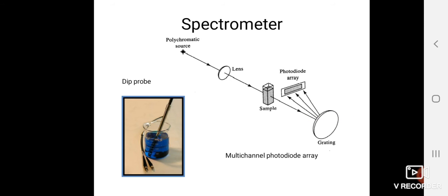so together these lights are almost coming out of the sample and the reference and fall onto the detector, so that simultaneously whatever the reference value is gets nullified from the sample value, and we are able to get the amplification of exactly only the absorbance which is happening by the molecules present within the sample cells. So that is what actually happens with the double beam.